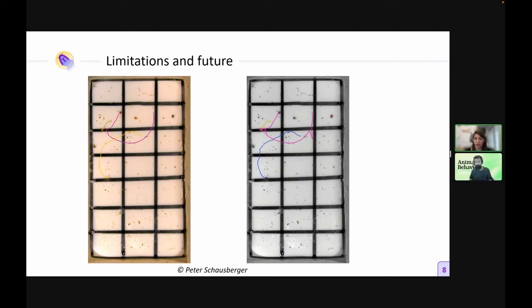AnimalTA is, for the moment at least, a very personal project. As you can see, in the authors we are only two. It's me and my previous supervisor, and I'm the one doing the coding. So regarding the funding, there is absolutely nothing. It also takes me a lot of time when we are doing an update. It means that I have my research. I'm not a developer, so it's also time that I spend on improving.